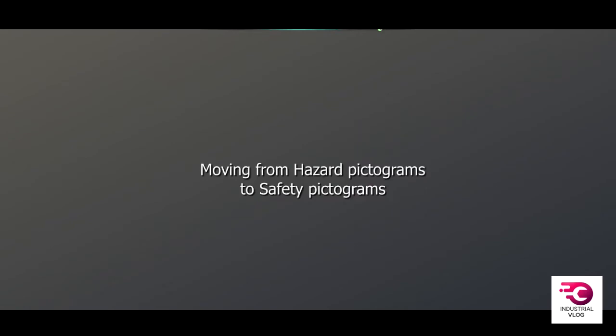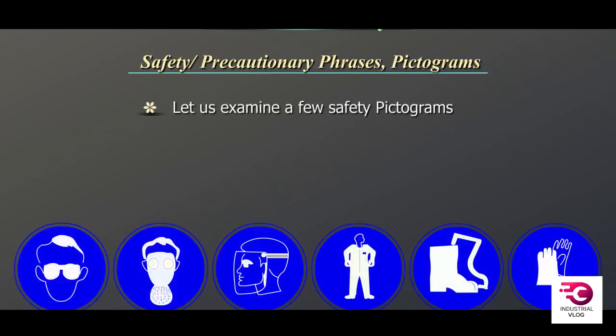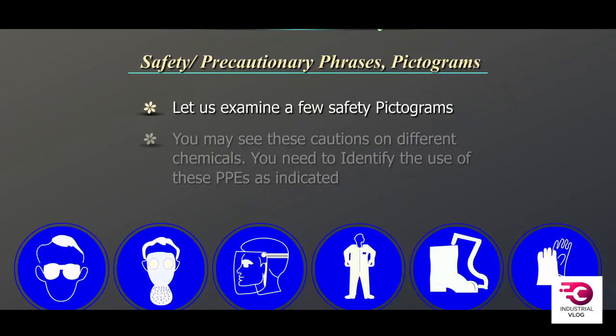Moving from hazard pictogram to safety pictogram. Safety or precautionary phrases, pictograms. Let us examine a few safety pictograms. You may see these cautions on different chemicals. You need to identify the use of these PPEs as indicated.